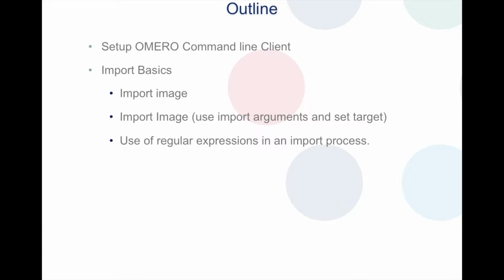To give you a brief outline of what we'll be covering in this video snippet, we'll be starting off with how to set up the OMERO command line client and then going into details of how to do some basic imports of images using the command line client.